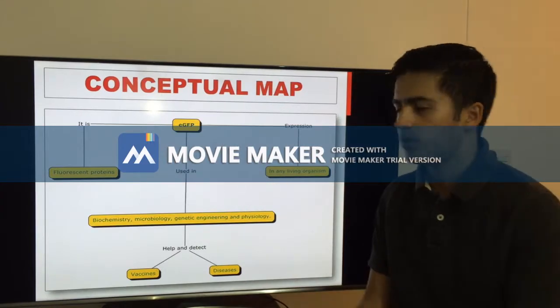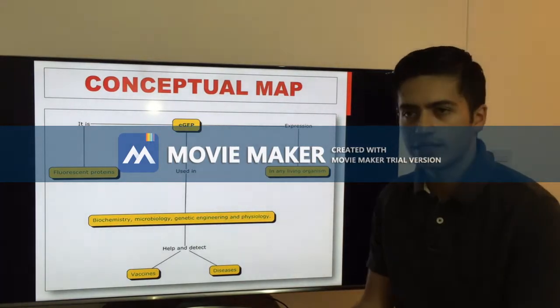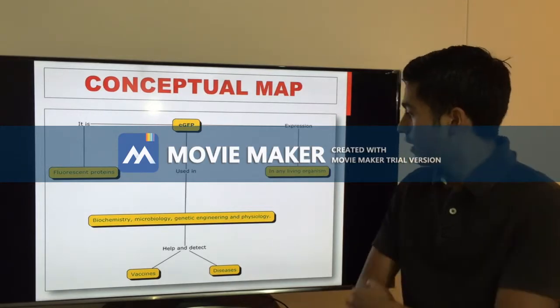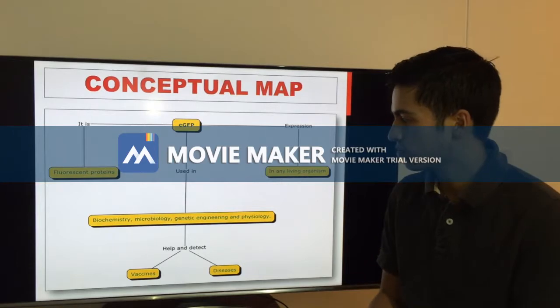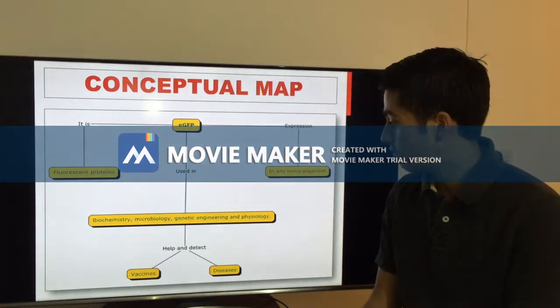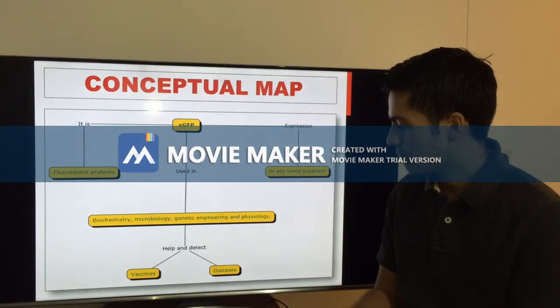The eGFP is a fluorescent protein that can be expressed in any living organism, and it is used in biochemistry, microbiology, genetic engineering, and physiology. It helps detect vaccines and disease.